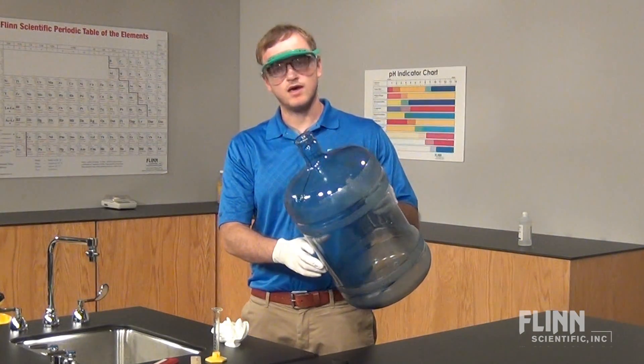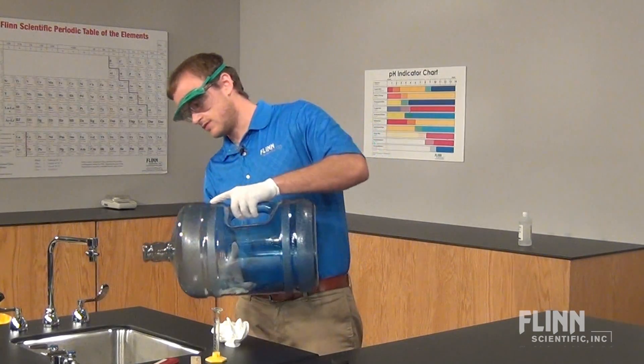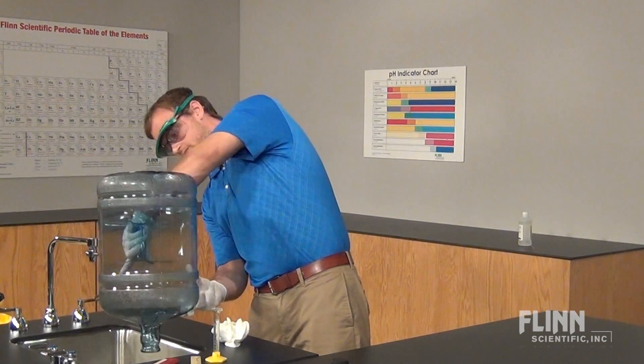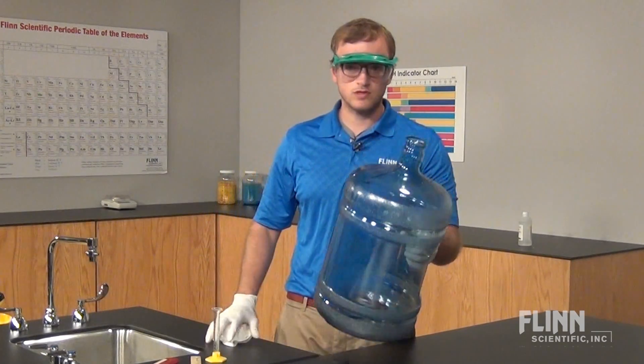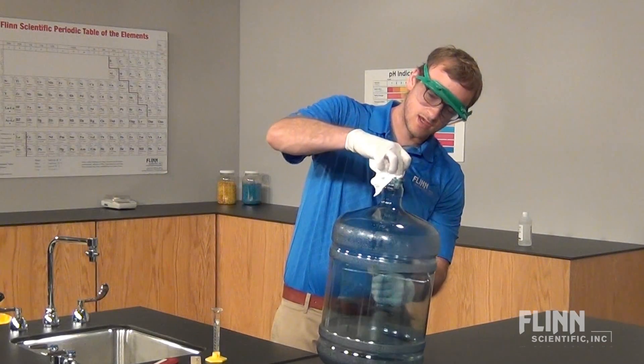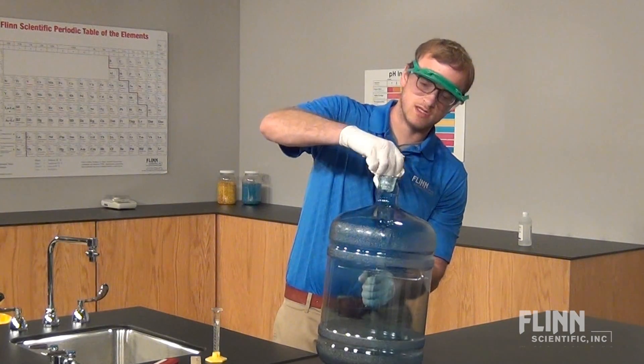Always pour out any excess liquid from the plastic jug. Also, it's important to wipe off excess liquid left on the outside of the jug and the inside mouth to prevent unwanted ignition.